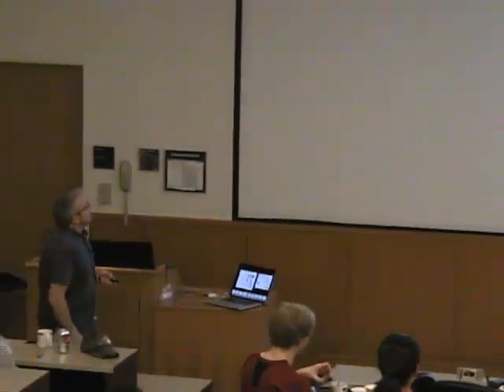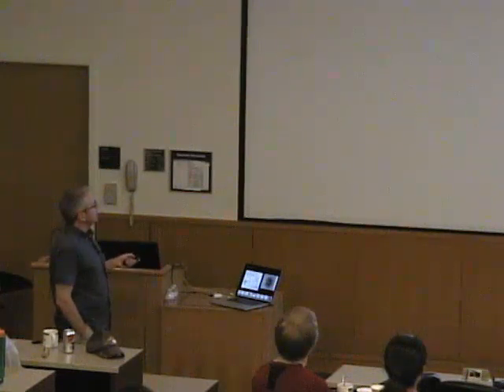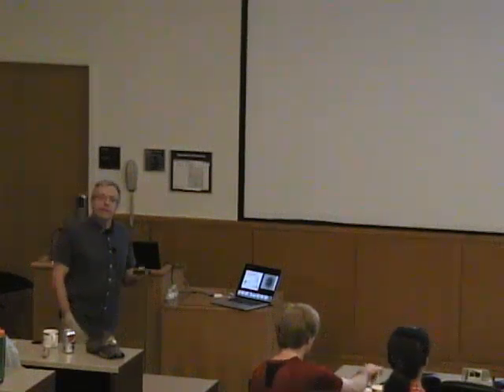Anyway, so it's all in all nothing else than electron microscopy. You still take your X-ray source, you still shoot those at your object, which in this case is a crystal, and I have to get back to that, and the X-rays get diffracted on that crystal. The problems start at the point when you say, why don't we take a lens and image what we get as a diffraction pattern, because there are no imaging lenses for X-rays.